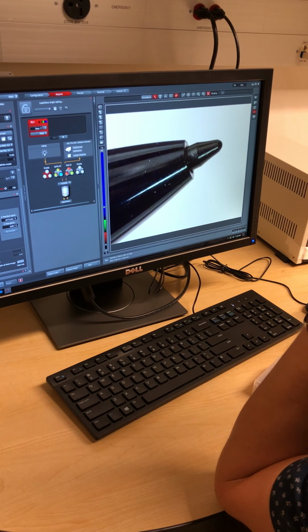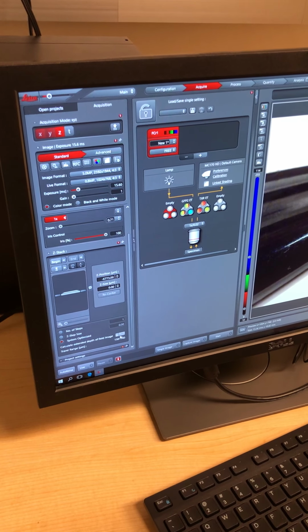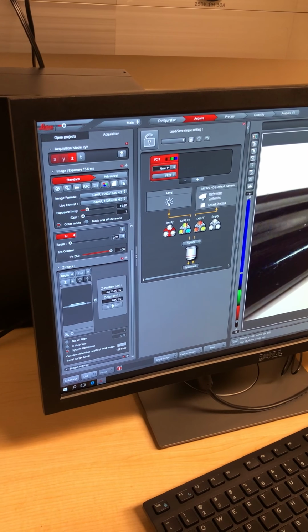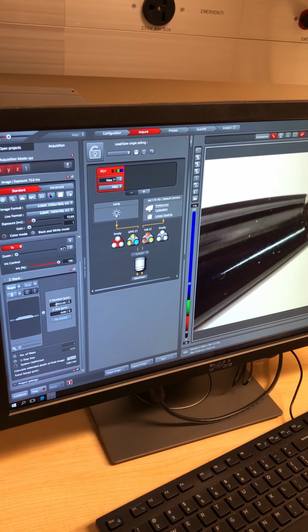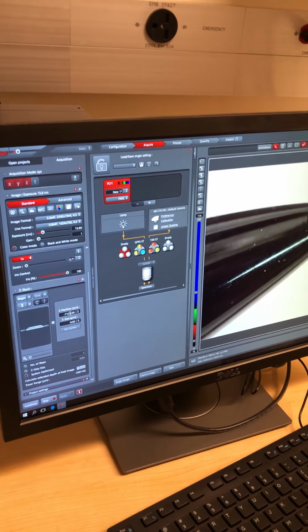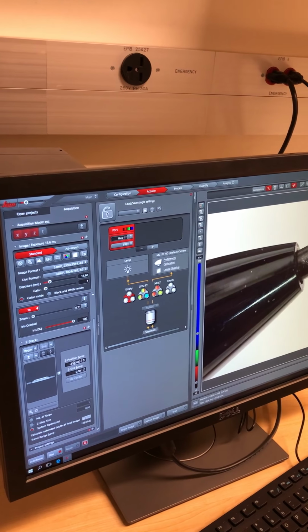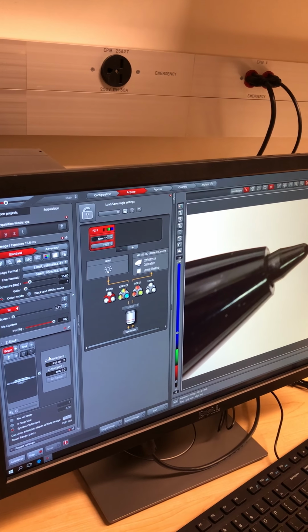All right, so there's this setting here, which says calculate extended depth of field image. I'm going to turn that on. Let me see, why do I not have this? Am I going up or down? Or do you want to go all the way down? Yeah, like that, that's good. And then go all the way up.